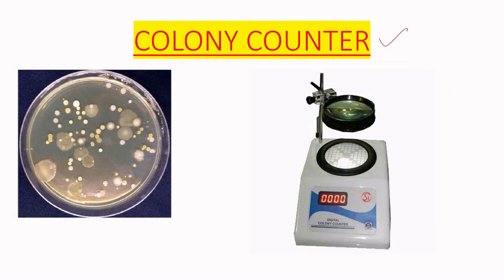This is the colony counter. After observation and getting the microbial colonies, this is the petri plate where we will see the colonies are present. These are the colonies of microbes or bacteria. We want to count these colonies.